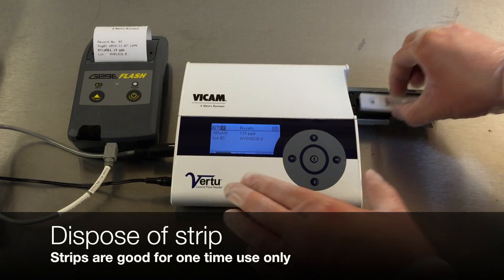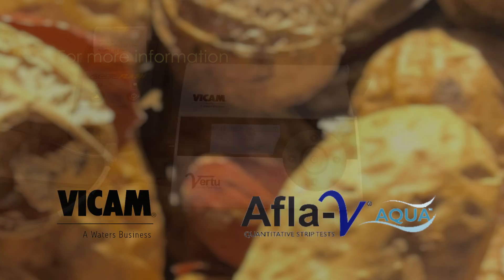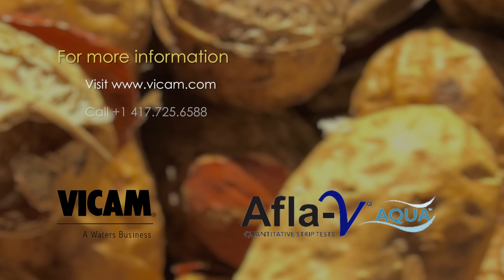Safely dispose of the extraction tubes and strip. These items are designed for one-time use only. For more information, visit our website.